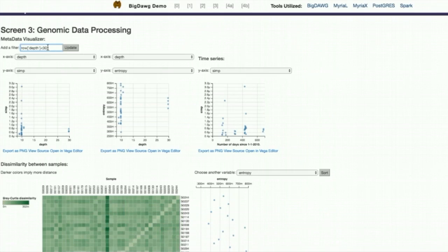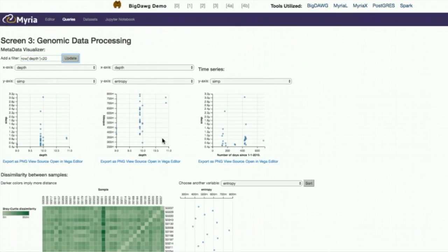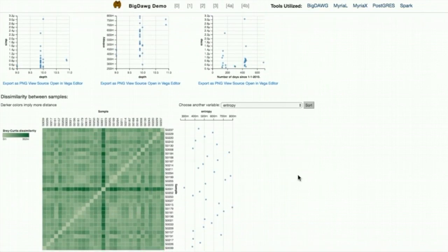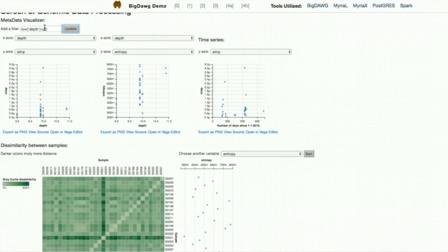So what you might do over here is select different row depths of interest. So you might want to only look for the sequences or samples related to collections when your depth was under 20 meters. You can update this over here, and what this does is pull in data. It'll only pull in the sample data to those related with samples under the depth of 20 meters.